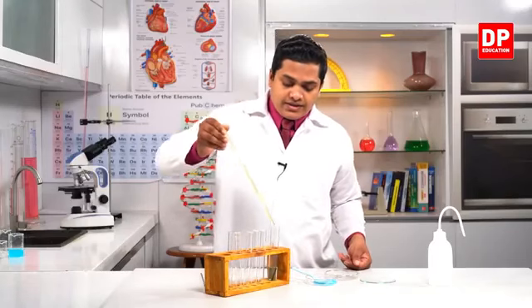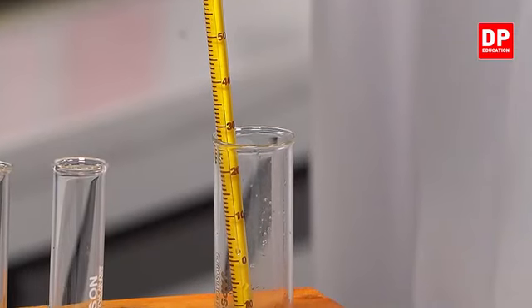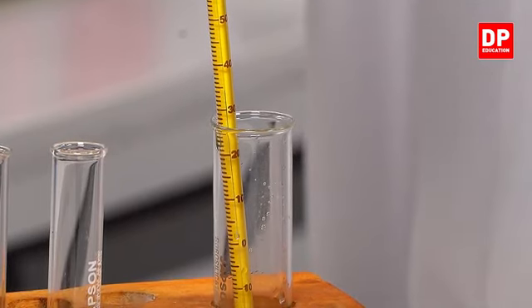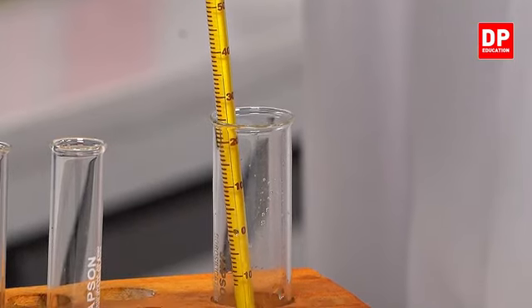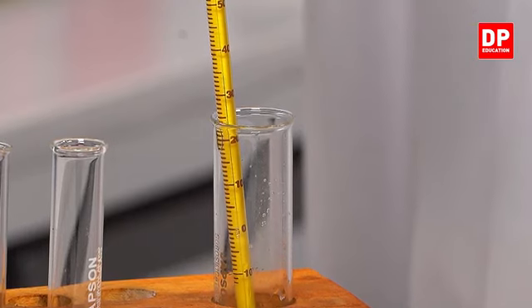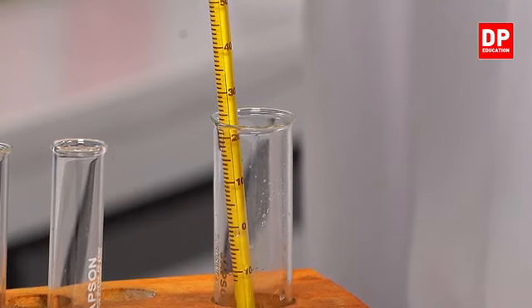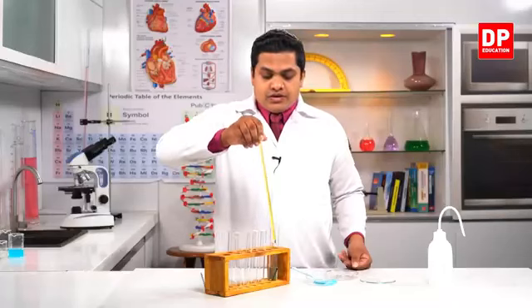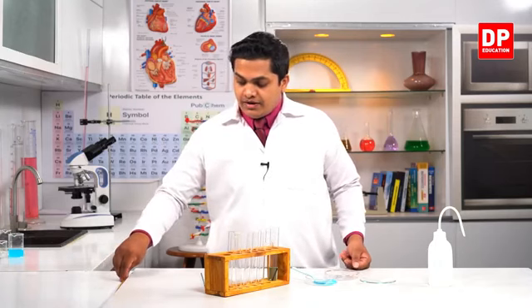Now I'm going to insert the thermometer and we'll observe how much the temperature is now. Right, now you can clearly observe the temperature has risen by 5 degrees. Up by 5 degrees means now the temperature is 35 degrees Celsius. Earlier it was 30 degrees Celsius. Now after the reaction, the temperature is 35 degrees Celsius. I'm going to keep the thermometer away.